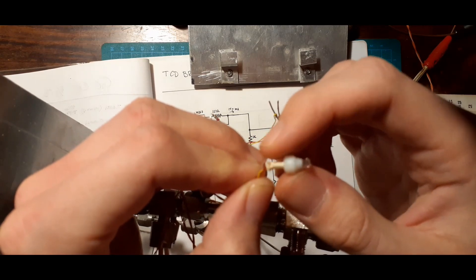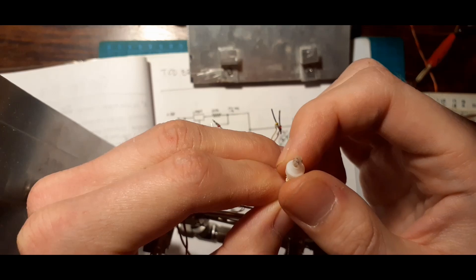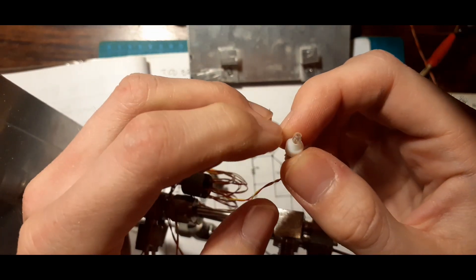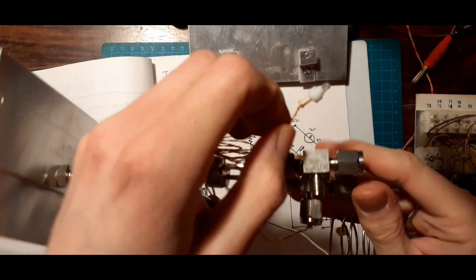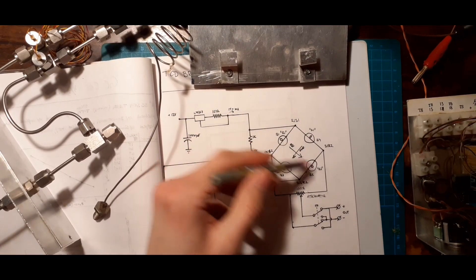It's crimped around the bulb, so I don't want to remove it. But this is just a light bulb cut open, very very carefully with some fine silicon carbide emery cloth. That's the little filament, the little tungsten filament that the gas passes over. And I have four of those on here, which corresponds to the ones you see here.